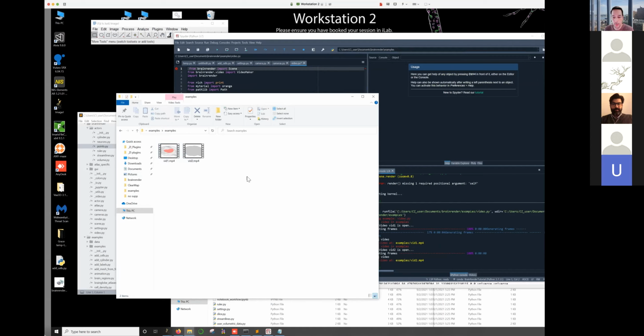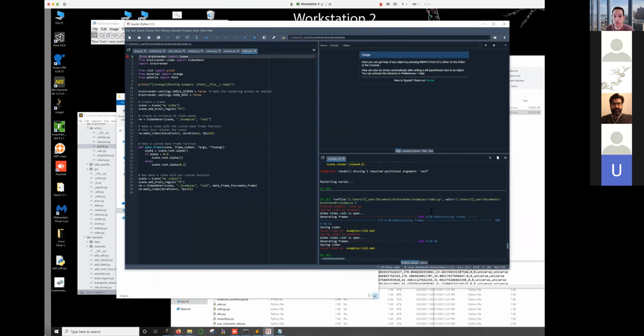An error that comes up a lot, at least when I've tried to do this, is that you need to have a program called ffmpeg. So what I would do is look in the console here. If you have any errors, just let me know. If you're actually getting these videos, that's great, then we can move on. But definitely let me know if you're not getting the videos. Okay, yep. Yep, that's it. So, okay, cool.